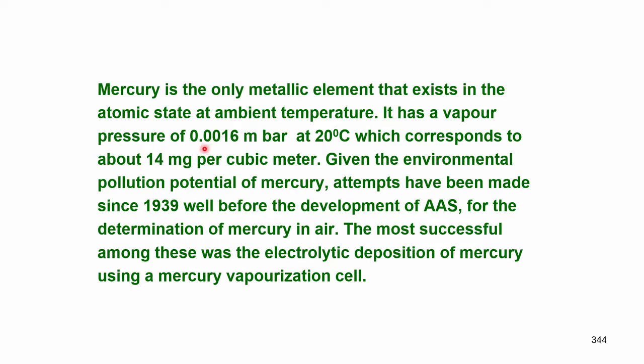it has a vapor pressure of about 0.0016 millibar at 20 degrees, which corresponds to 14 milligram per cubic meter. So, that means nowadays the standard is about 0.001 milligram per cubic meter, that is the standard we are supposed to breathe. But normal spilling in the laboratory gives you 14 milligrams.